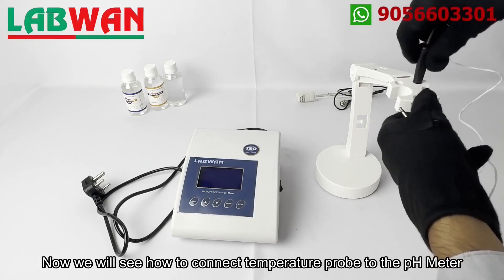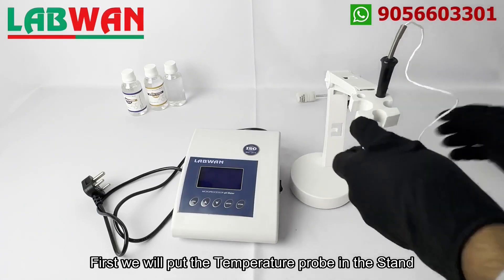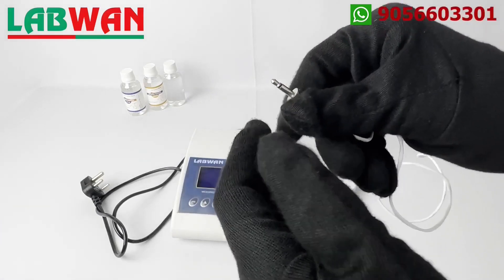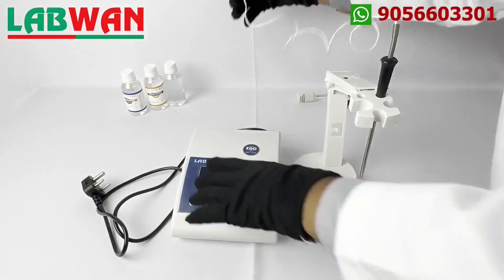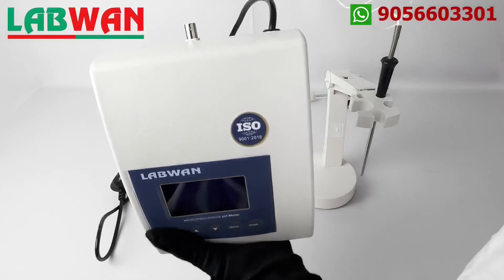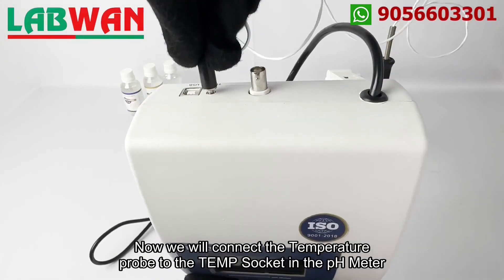Now we will see how to connect the temperature probe to the pH meter. First we will put the temperature probe in the stand. Now we will connect the temperature probe to the temp socket in the pH meter.